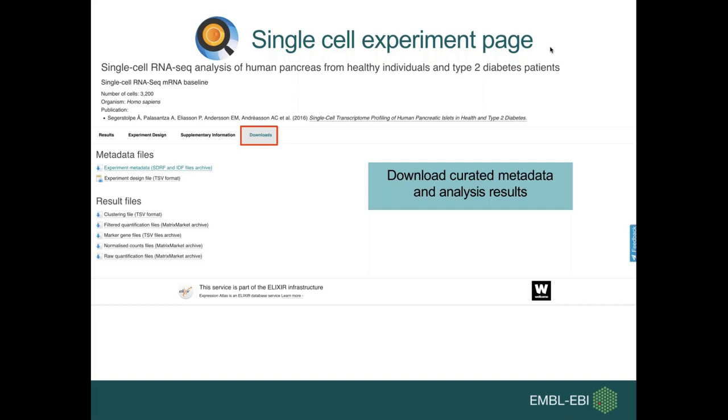Can you run this on data acquired from different experiments? Yes, we can. That's actually what the Atlas is doing. We are running the same pipeline on different experiments and then showing the results in a t-SNE mode, or several of them actually.